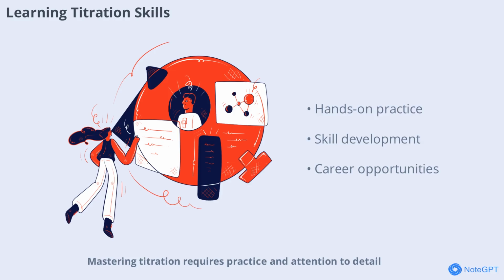Mastering titration requires practice and attention to detail. Students and professionals alike benefit from hands-on experience, learning to handle equipment and interpret results. Developing these skills opens doors to careers in science, medicine, and industry, making titration an essential part of scientific education.